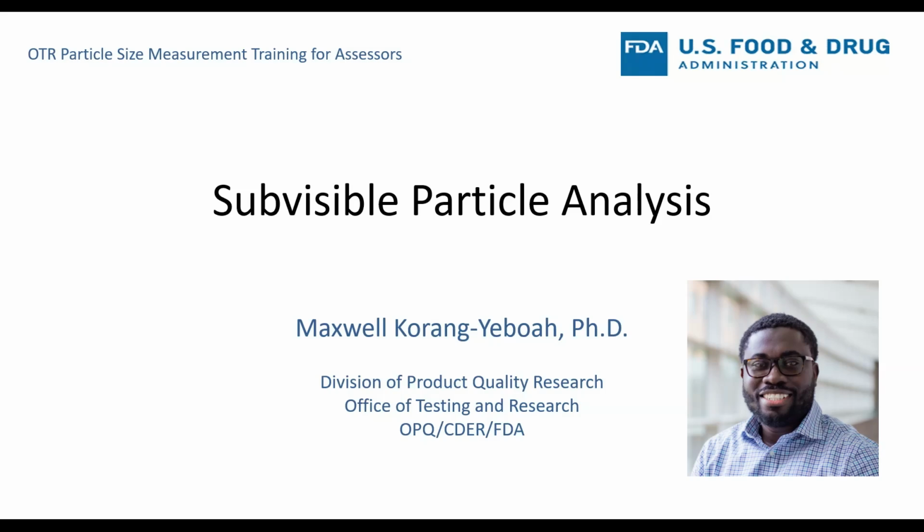Over the last 2 days, we've been looking at analysis of intended particles, liposomes, nanoparticles, suspension drug products. I will take a little bit of a digression where I'll move to unintended particles in our products, especially in parenteral products, specifically analysis of subvisible particles. The techniques we're going to talk about could be used for analyzing intended particles. So you would see one or two things that are put in there when it comes to its application for intended particles, such as nanoparticles, liposomes, and other drug products.